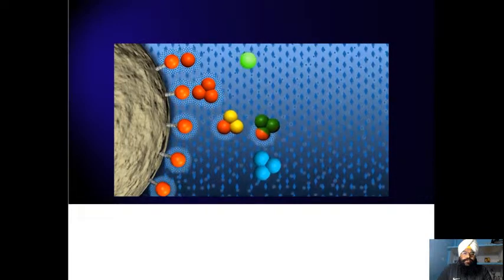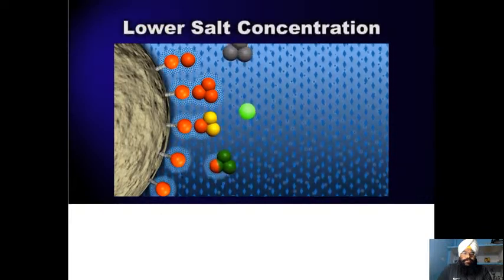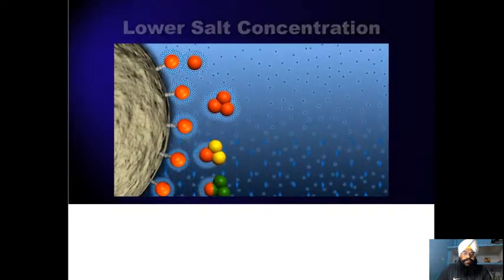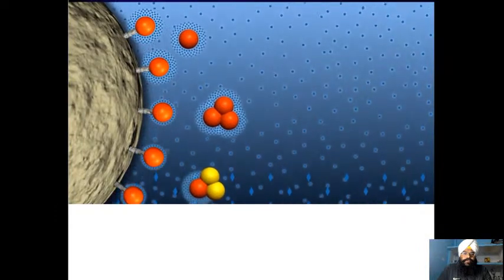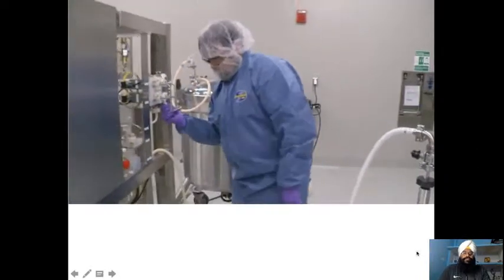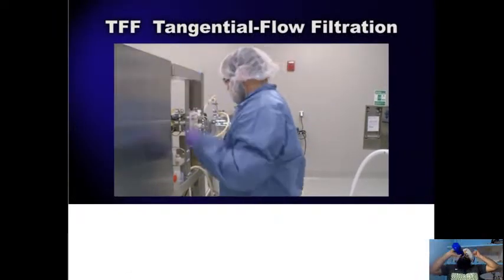To remove the attached GFP protein from the HIC column, we simply lower the salt concentration during elution, causing the water shielding to reform, and the GFP protein detaches from the resin into the elution stream. The protein-rich eluate is collected and pooled. The product is now ready for the last major step, TFF.